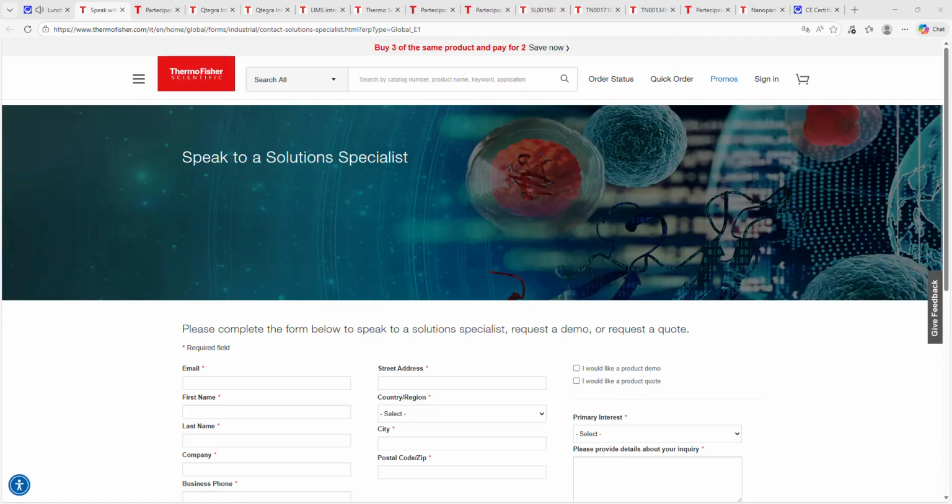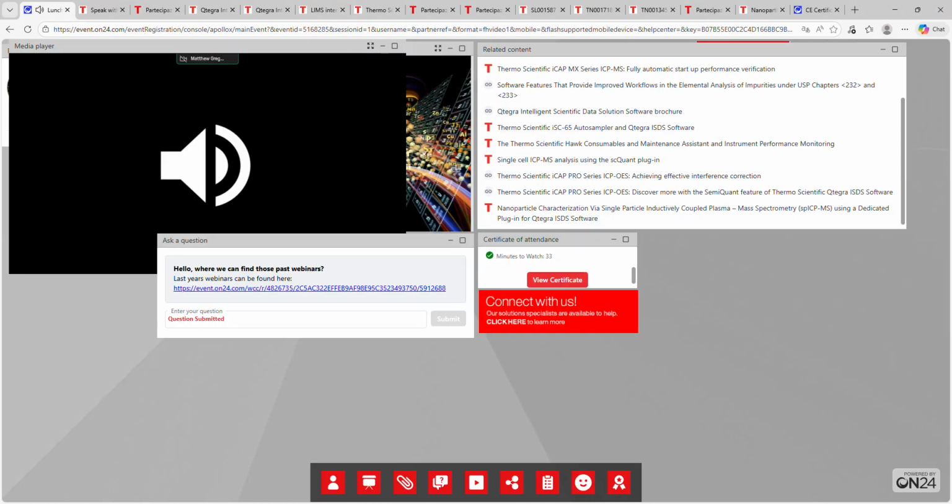It could be in the water itself. Iron, I know, is quite easy to contaminate with. You could try just aspirating air through the system. Do the counts change when you have air going? Then you can identify whether it is in your system or in the water itself.